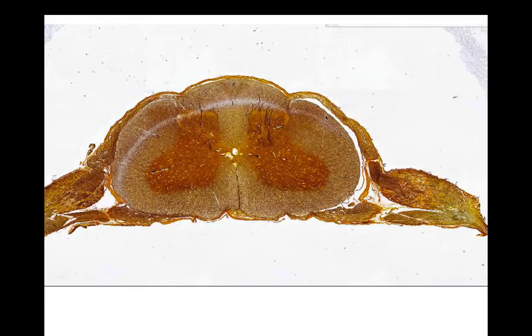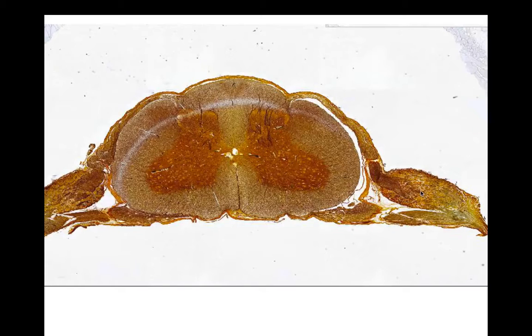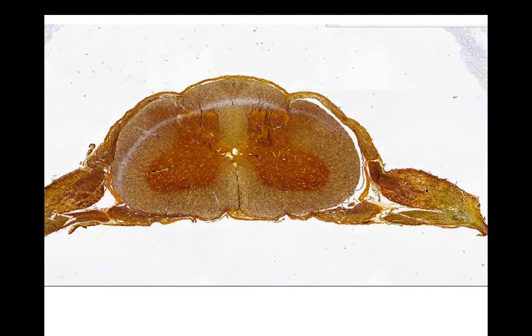Here's another good cross-section of the spinal cord. Again, you see the dorsal root ganglia here. The lateral horn is going to be around here, and the anterior or ventral horns are going to be here. At this magnification you can start seeing the cell bodies in the dorsal root ganglia. Remember, a ganglia is a collection of cell bodies in the PNS — these are going to be sensory afferent unipolar neurons.